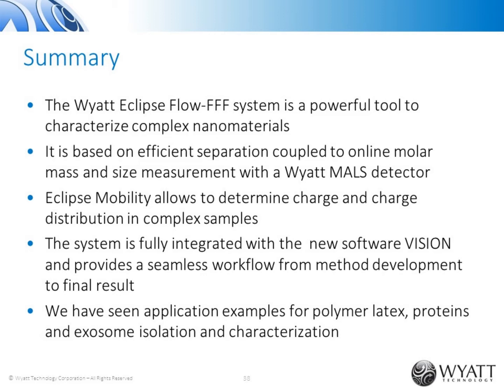So we are able to both separate and also characterize a change in size that happens by interaction of a particle with the protein or with the polymer.